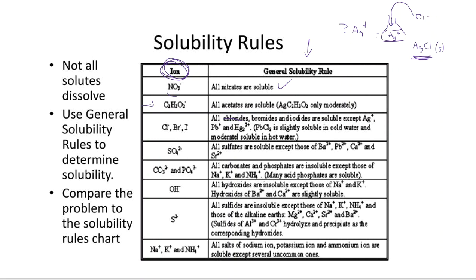And in gravimetric analysis, we want masses. So what that means is that I don't stop here. I then will take this solid, I will filter it just to get the solid only. I will then dry the silver chloride precipitate that I have there, and then I'll get a mass of that silver chloride. Now, let's say that I had 5 grams. Okay, I've got 5 grams of material.